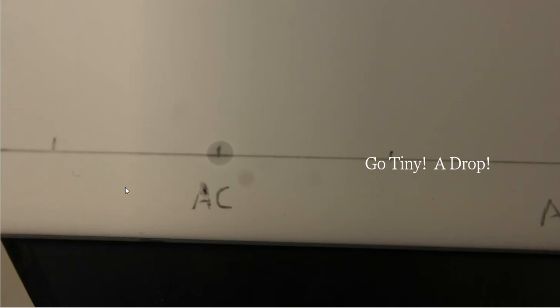This spot that I see, the diameter of the spot is not very large, okay? The smaller this spot gets, the better uniform the spot's going to be in the very end. In other words, I don't want to see smears. I want to see spots at the very end of this. And one of the reasons that I would see a smear is I've put too much. So as this component travels up the plate, it's not going to travel together. There's going to be some lag.